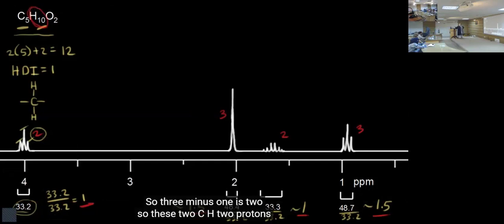Now, looking at the spectrum, this is the number of protons, 3. The red color shows the number of protons which comes from integration values, the intensity. And integration is also mentioned on the back side of your proton NMR spectrum, so you can also calculate the exact number. So here there are 2 protons and it's a triplet. What does this mean?